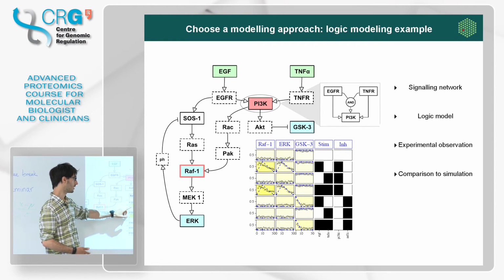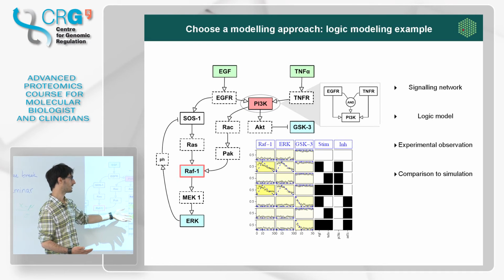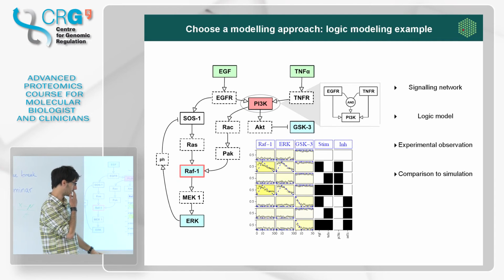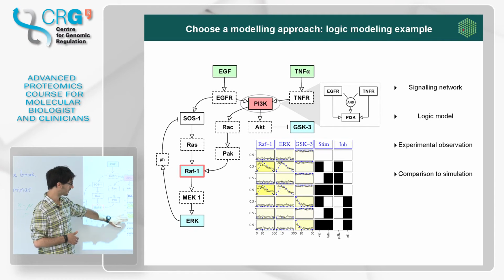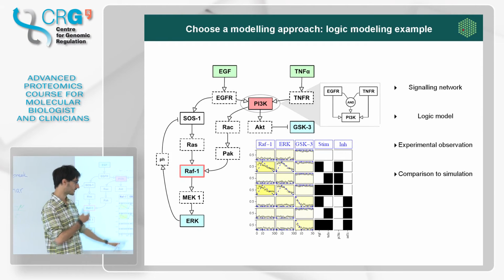Then what we do is we measure the difference between them. And when we see the difference between them, we use that to decide whether this is a good fit or not, and we display that on the background using this color that you see here. So this darker background than this one shows that the fit between this simulation and this data is worse than this fit that is better, or this fit that is very good.